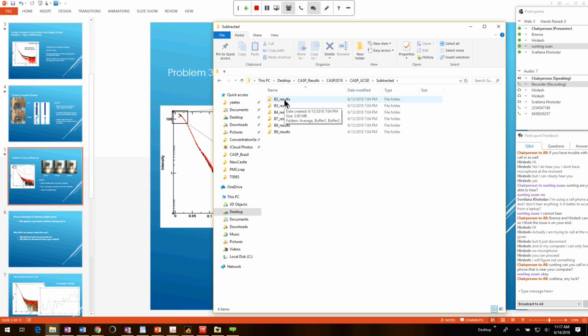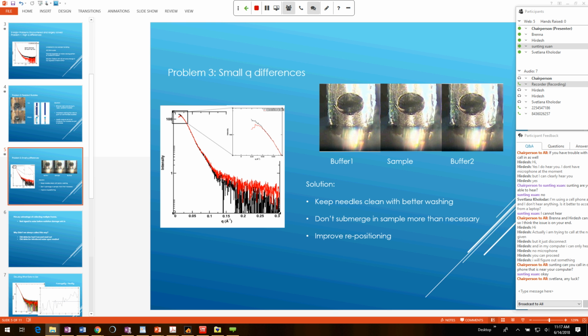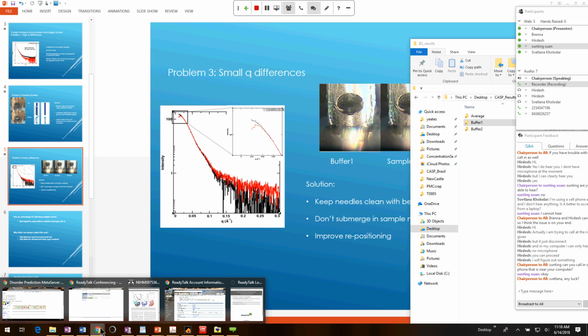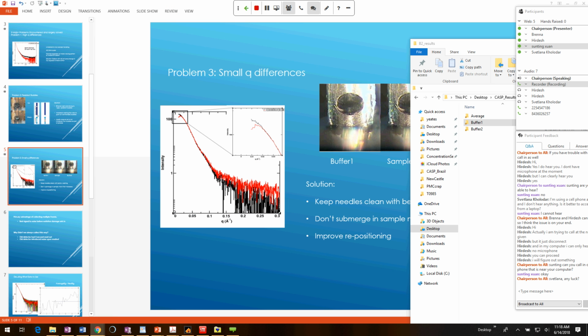But in each directory, you'll also have your buffer 1 subtraction, your buffer 2 subtraction, and your average. Within your buffer 1 subtraction, you'll have your 33 frames that were collected. So let's open up a tool here to start processing that data.